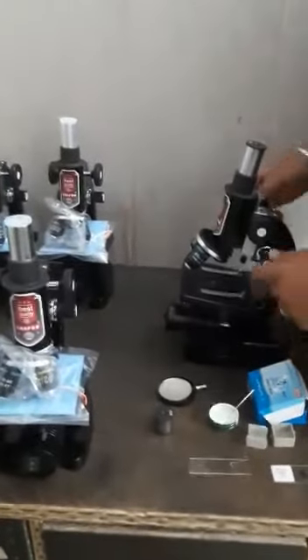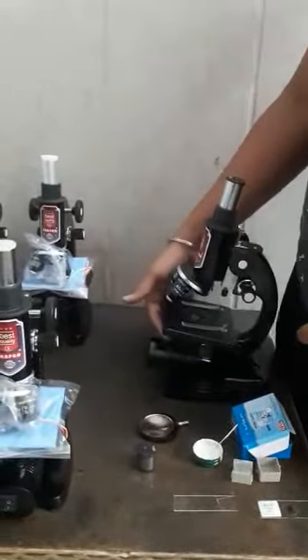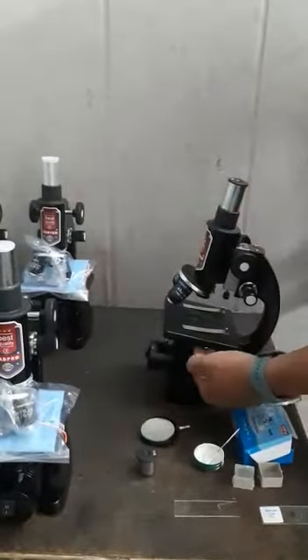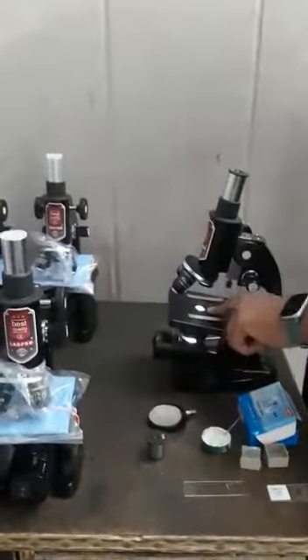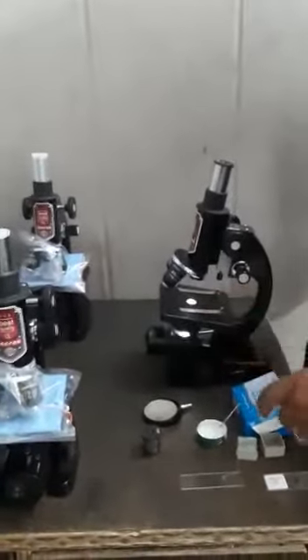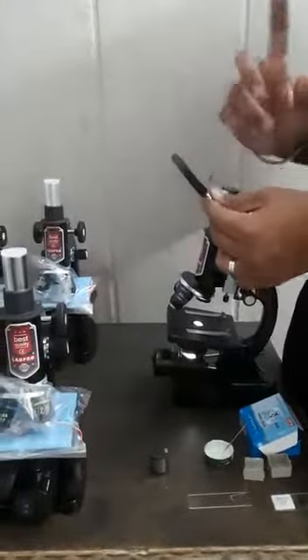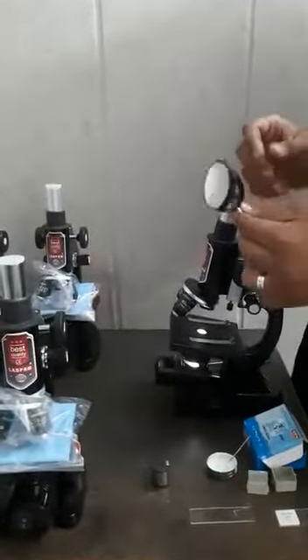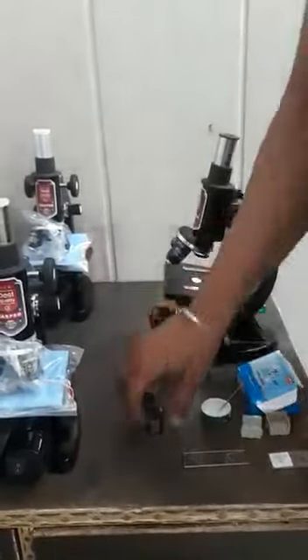First of all, this is a slide containing a specimen. The first thing you should take care of when using the LED lamp is that the light from the lamp should pass straight through the microscope. We will switch on the lamp — you can see the light passes through properly. In other cases, if you use a reflector, please take care of proper lighting in the room to get proper results.